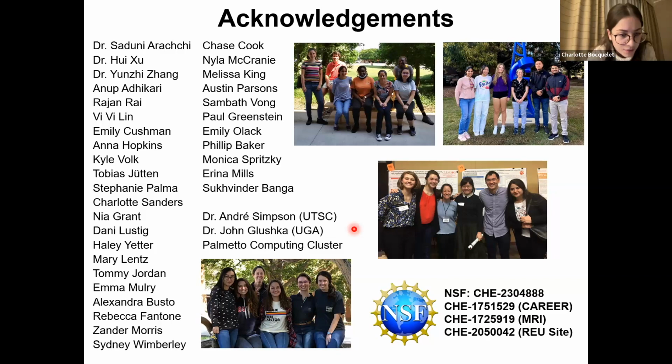We have another question from Chileum. How do solvent properties influence the STD NMR analysis of small molecule nanoparticle interactions? And are there specific solvents or solvent conditions that are particularly advantageous? So we've been using mostly D2O. I feel like any solvent that is not going to significantly influence the viscosity should work just fine.